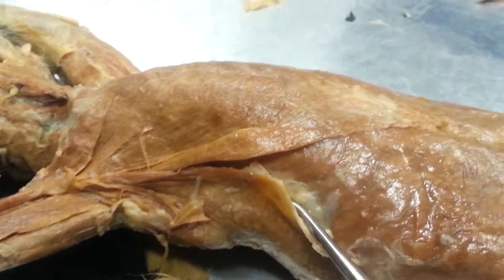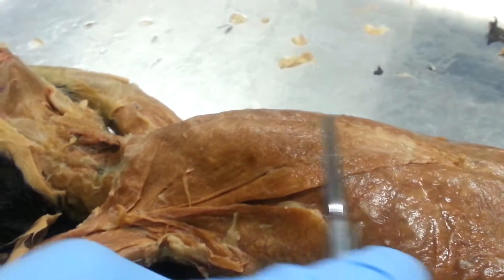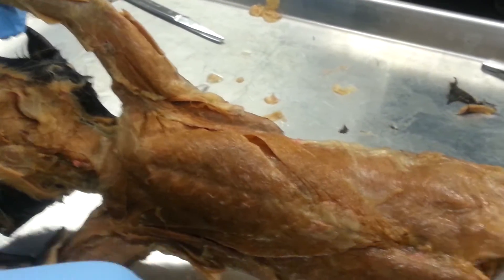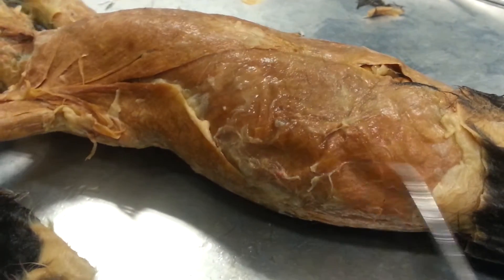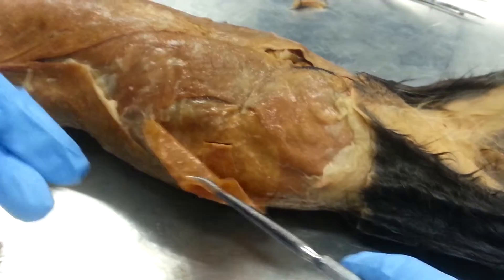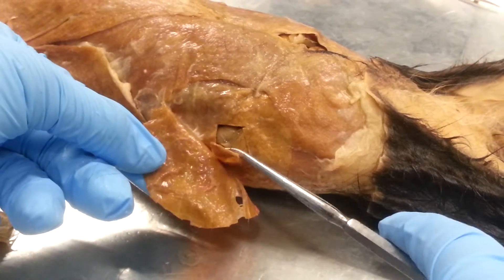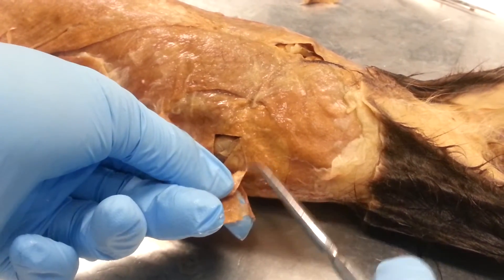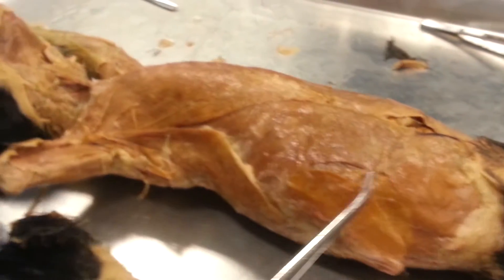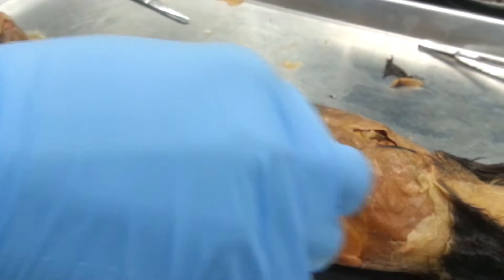And then this is the latissimus dorsi. And then the linea alba. So here is the external oblique. And then underneath is the internal oblique. And then underneath the internal oblique is the transversus abdominis. And here is the rectus abdominis on the side.